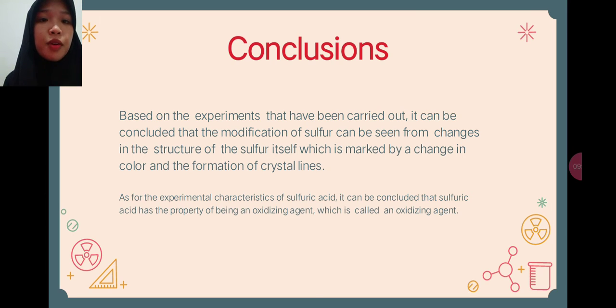As from experiment characteristic of sulfuric acid, it can be concluded the sulfuric acid has the property of being an oxidizing agent.